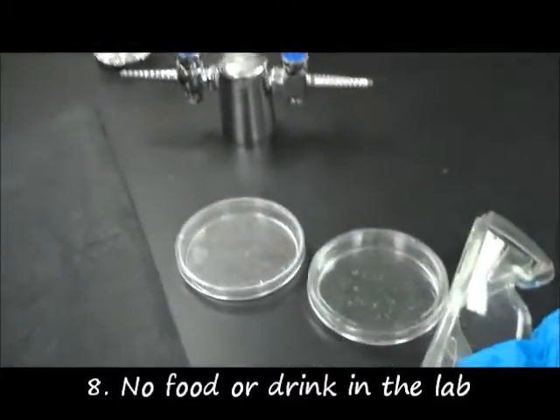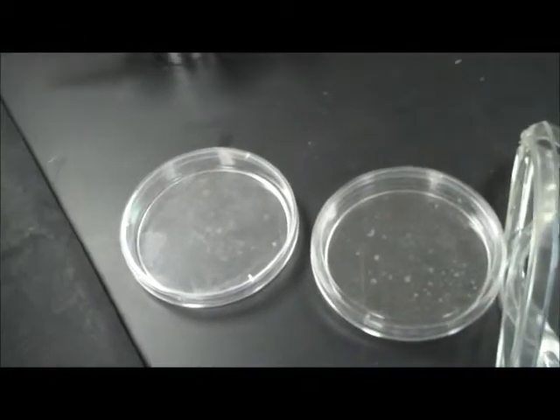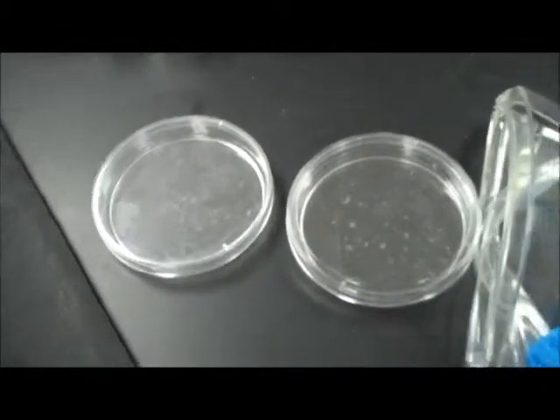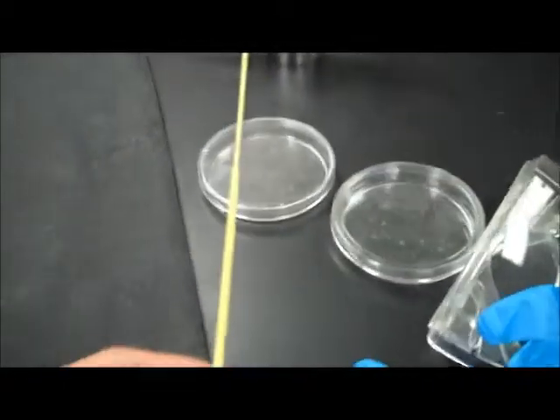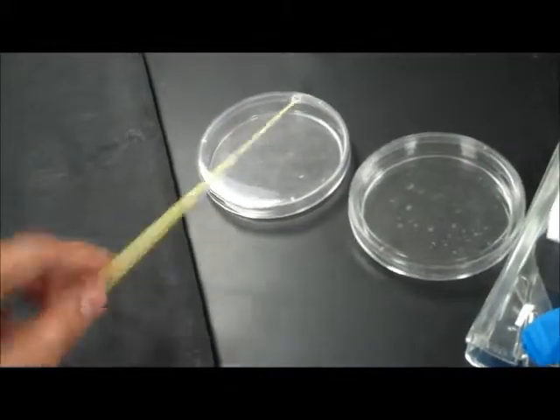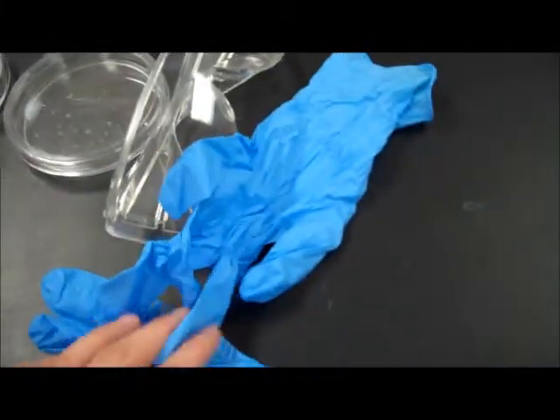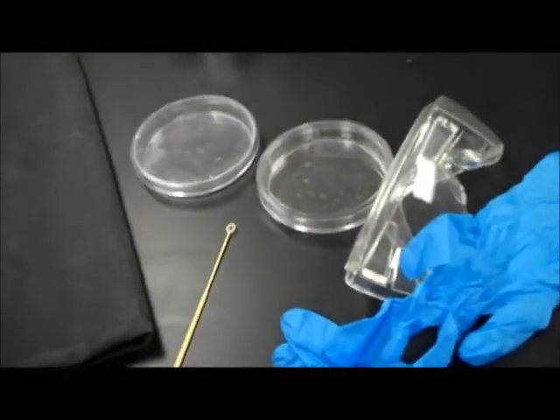At this table, you happen to be working with Petri dishes. When we use Petri dishes, we'll be working with bacteria. When you're working with bacteria, you also use an inoculating loop like this to be able to handle the bacteria on the Petri dish. You're also going to wear gloves. All of these things are to protect you from being infected by the bacteria.